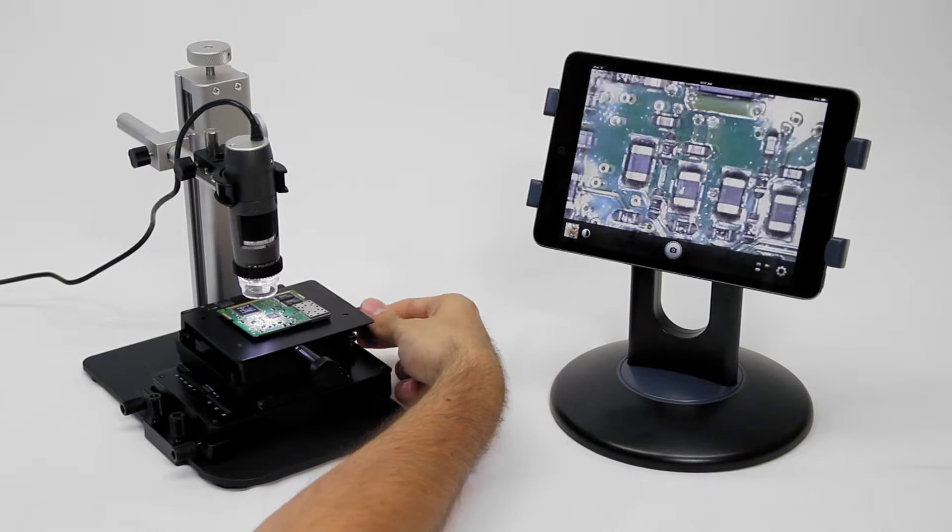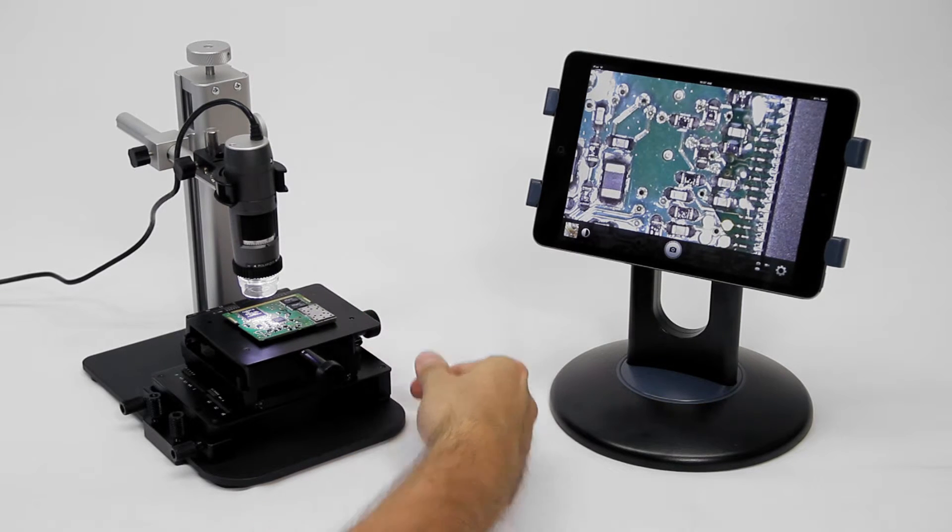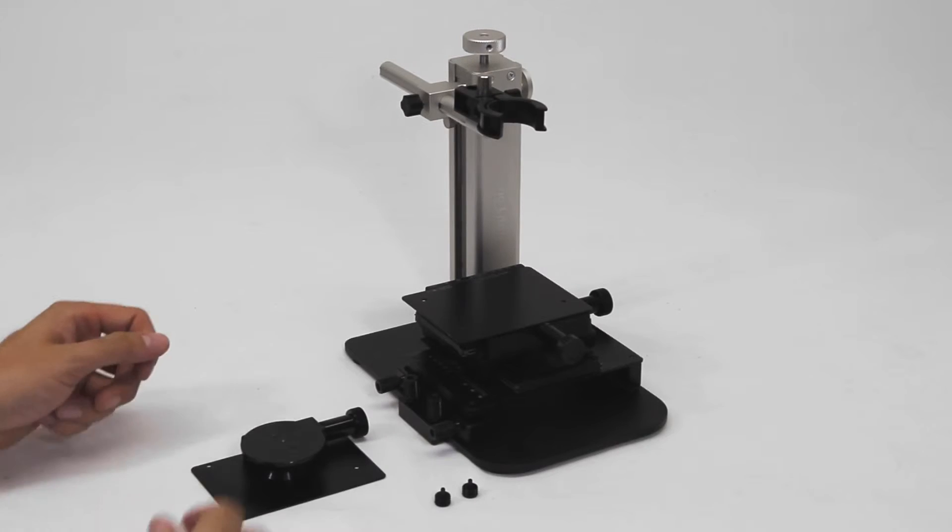The MS-15X has smooth fine adjustment knobs for precise XY movement, as well as an attachable rotating table for rotational adjustment.